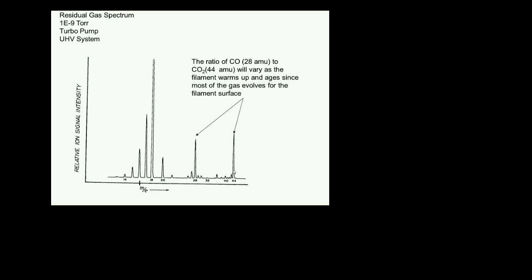And I'll give you an interesting story. I had a friend of mine who detects carbon dioxide emissions at the bottom of the ocean. He was doing some studies at a sulfur emitting place, and he took an RGA down there in a submarine, and he turned on the RGA and realized that there was carbon dioxide on his spectrum. He didn't know this rule about what the residual gases are. He was kind of new to the methodology. And so he wrote a paper saying that for the first time he had observed carbon dioxide emission from these fumaroles at the bottom of the ocean in this place.